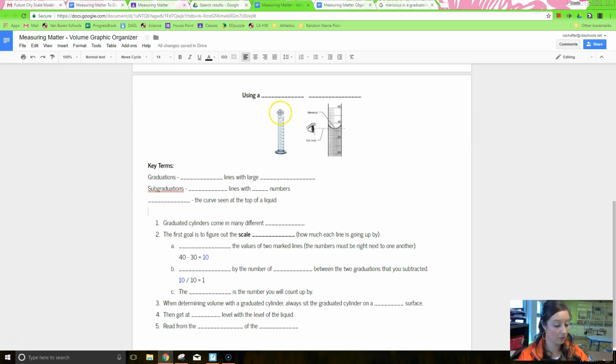So like I said, this whole video is going to be all about using a graduated cylinder. Now, graduated cylinders actually come in many different sizes. So we're going to jump down here to this number 1 and fill in that blank.